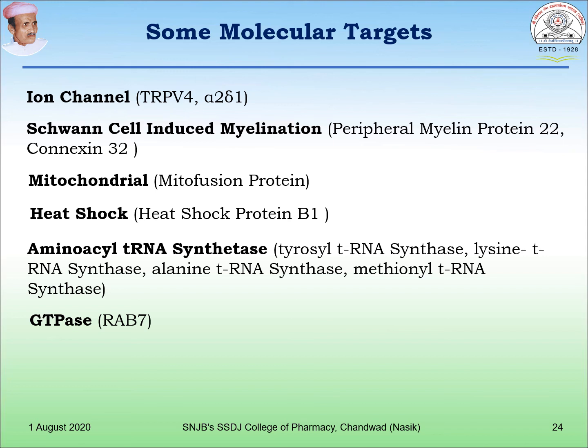Apart from that, you can go with the histopathology of sciatic nerves, which will give you the anatomical changes in the sciatic nerves. You can also go with antioxidant parameters or oxidative stress markers. If you want to go further to the molecular level, you can use RT-PCR and gel electrophoresis. So there are a number of things which you have to carry out during this peripheral nerve evaluation.